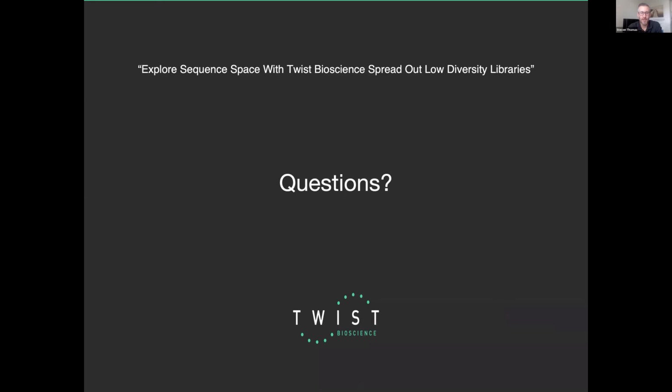Can the library include indels, in-frame or otherwise? If you are talking about combinatorial variant libraries, yes, you absolutely can do that. That's the beauty of being able to synthesize each variant base by base. If you have a list of variants that's been pre-designed and you want us to synthesize all of that and incorporate it into your library, absolutely no problem.